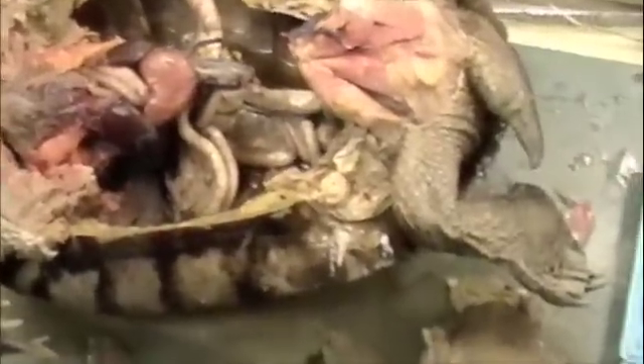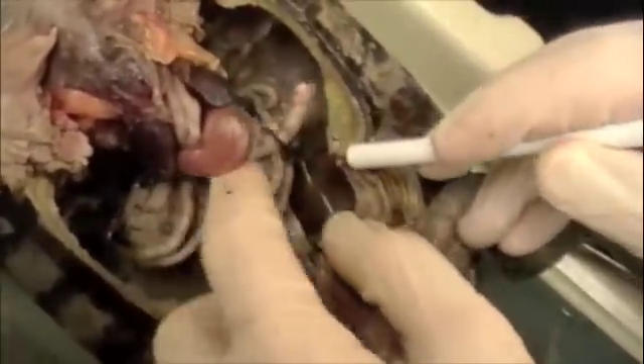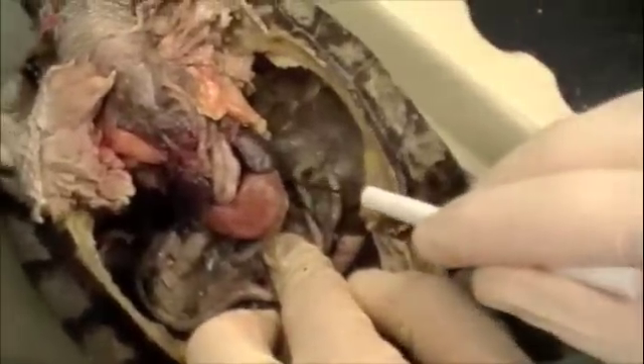So we have the small intestine — you can see right there — and the gallbladder, I think. Here's the bladder. One testy, two testes. Connecting to the large intestine. Small intestine. Stomach. We need a light on this. Okay, that is the lung — it's dorsal to the carapace.